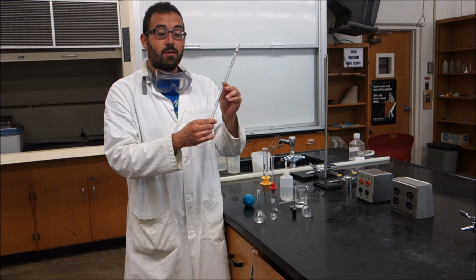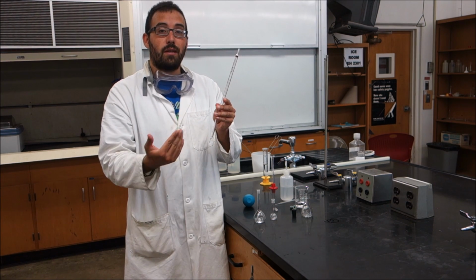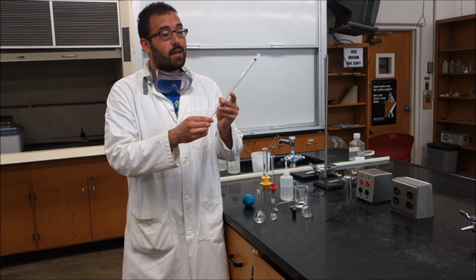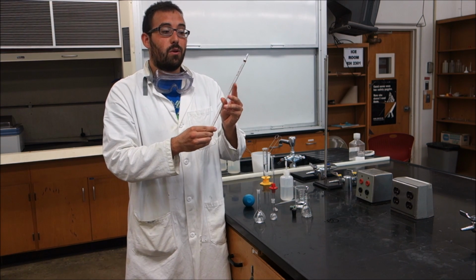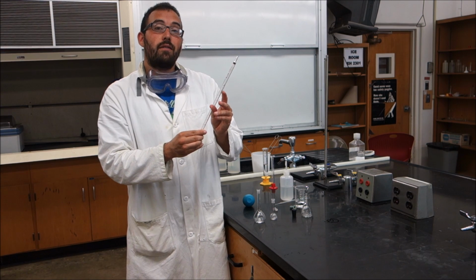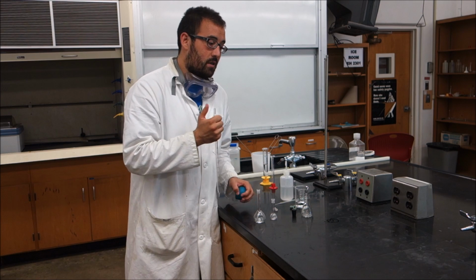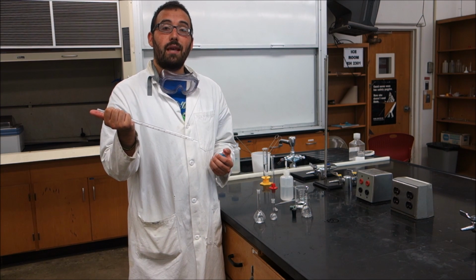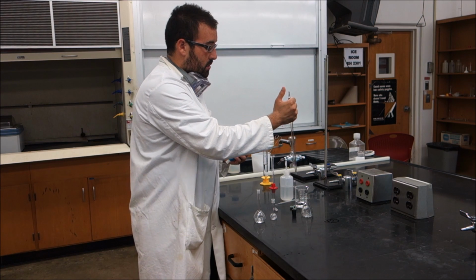So if we go from 0 to 2, that's 2 milliliters. If we go from 2 to 4, that's another 2 milliliters. If we go from 0 to 8, that's 8, or 1 to 9, that's 8 as well. So it's a simple subtraction between what number you end at from the number that you start at. Now, if we want to transfer 2 milliliters, it's going to work much in the same way as your transfer pipette worked, your volumetric transfer pipette.